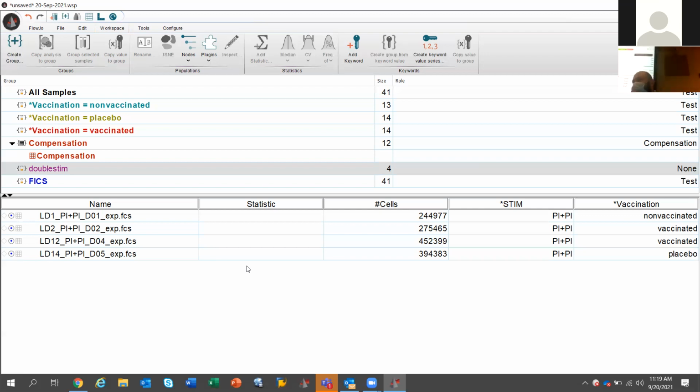Please do not use isotypes. Isotypes are not legit. There's already enough papers saying that. If you have questions with your PIs, because some PIs will still say, hey, where's your isotype? That's not a thing. I could email the articles that have been published even recently, because it's still, for some reason, an argument, showing that isotypes are not good controls.